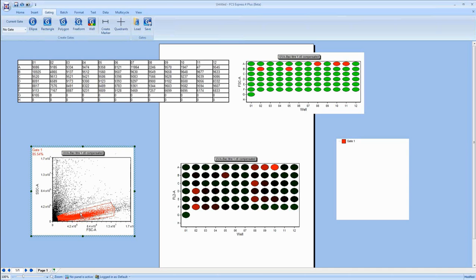All we have to do is take that gate, drag it onto a heat map, and you'll notice probably it didn't update too noticeably yet, but that gate is applied, and we can see that if we click on that plot and look up here in the current gate, it says gate 1 is applied. So watch what happens now as I move this gate around. You're going to notice that the heat map colors are going to be updating and changing for us, because this heat map is now only showing data that's from cells that fall within this gate that we've created on the plot.